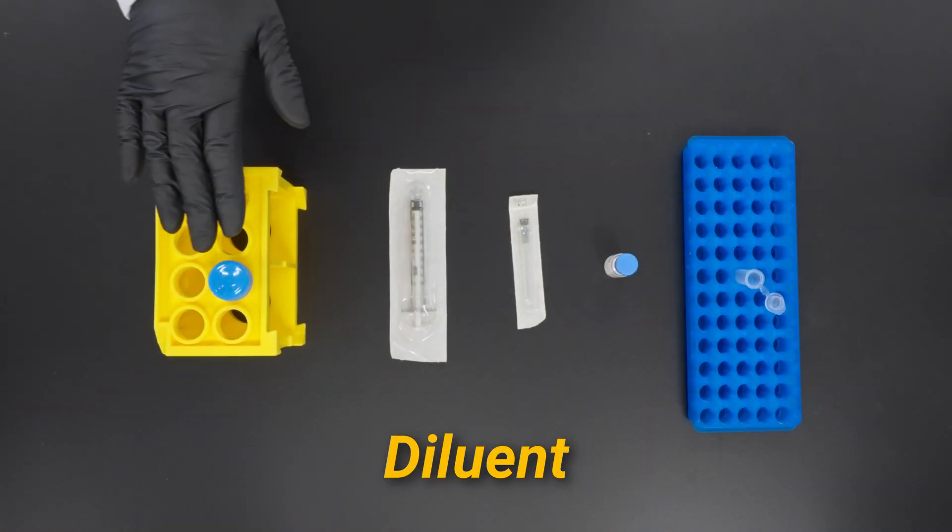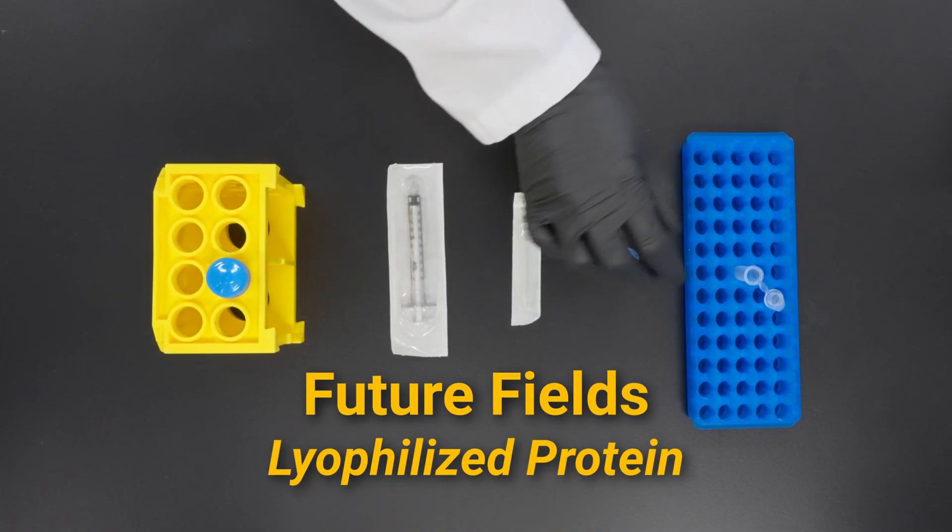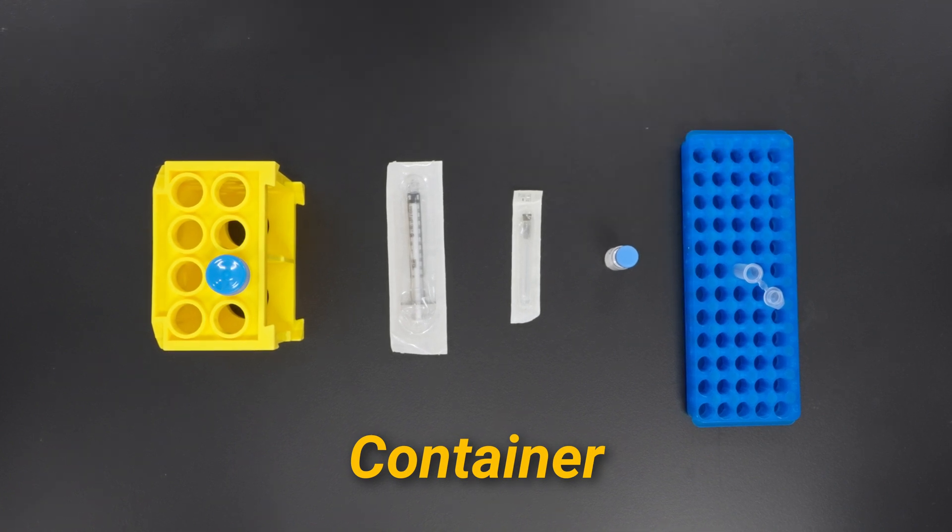You're going to need a diluent, a syringe, a needle, your lyophilized product, and a container to dispense your product into.